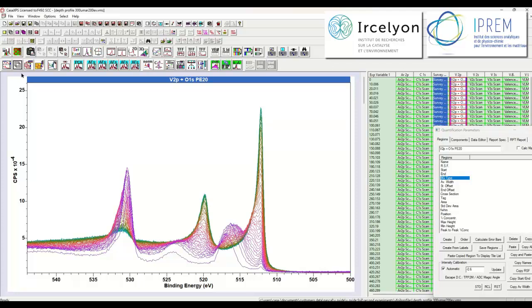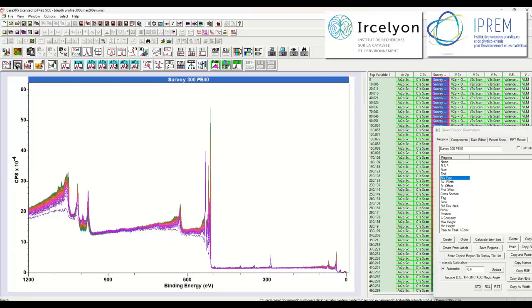So let's perform the analysis as we previously performed on the helium example that involves the survey measurements, and I would like to pick out the same interval in terms of energy in these data as I used in the helium. So I've got these selected.